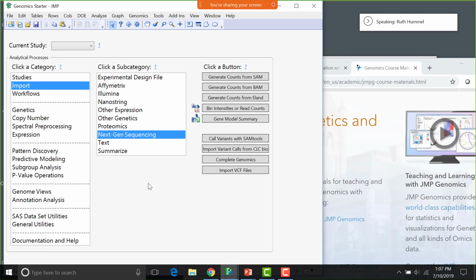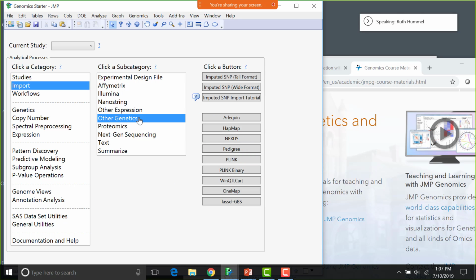And for SNP, which kind of data do we have to input? Again, text files are always easy. You might have imputed SNPs in different formats. You might have data coming from any of these software packages. In my experience, I'm very often reading in text or CSV or Excel files for a lot of things, but that may be because I'm usually getting them secondhand, not straight from the other software. So again, if you don't find a tool for what you're looking for, send us a question and we will be able to help you figure out if your particular data set can be read in.